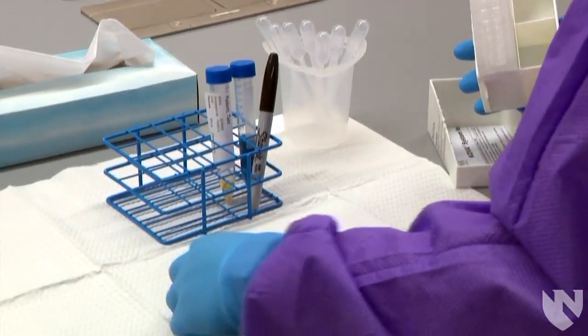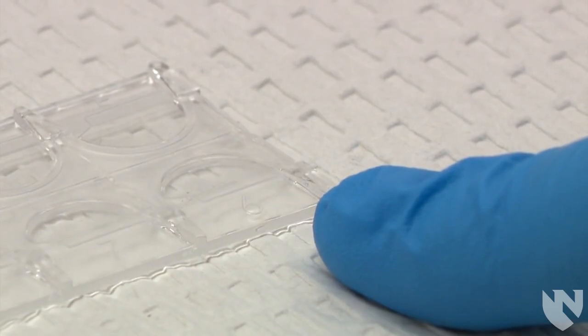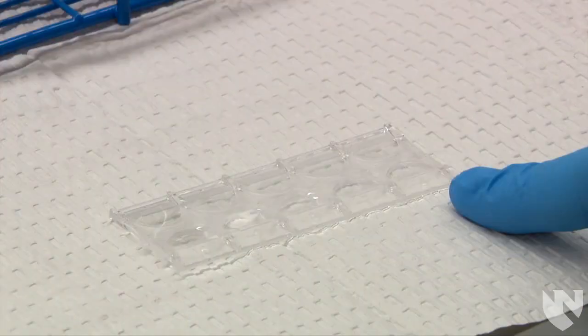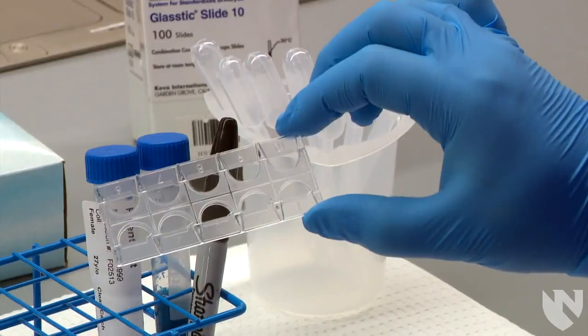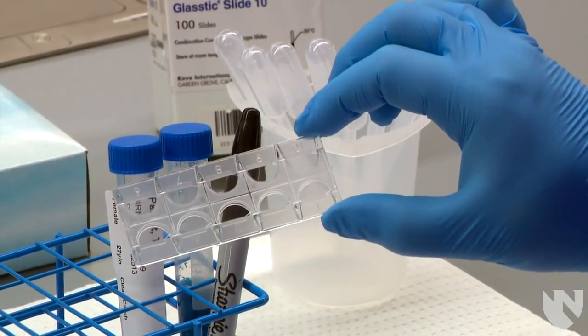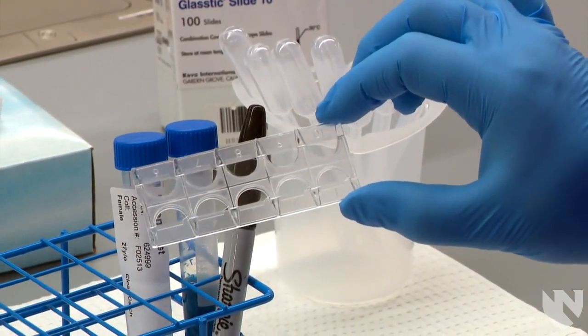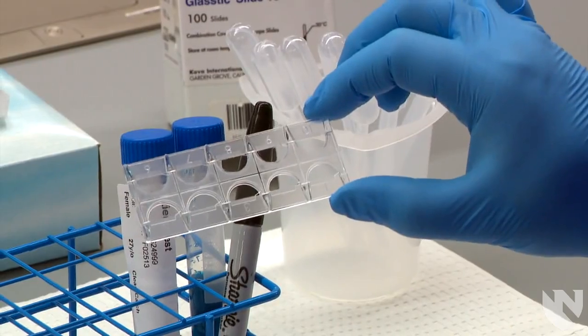Place your Cova slide on the white mat and decide which well you are going to load. The wells are numbered from 1 to 10. Some people also hold the Cova slide upright in their hand if they have trouble loading the sample when the slide is on the bench.